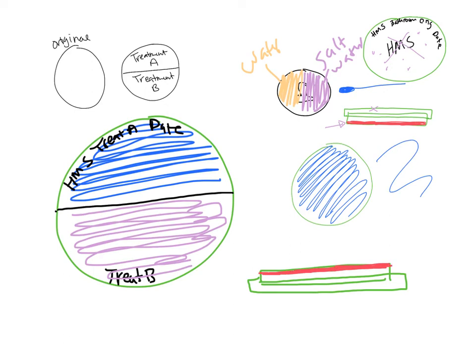So you're actually going to put them upside down, and you'll stack those three like we did when you took them home, and then there'll be the third one. Then you can tape them up again. When we get back to lab, I'll show you how to use some parafilm. If you got parafilm when you went home, it's just a little piece here. It's sort of like wax, but a film wax.